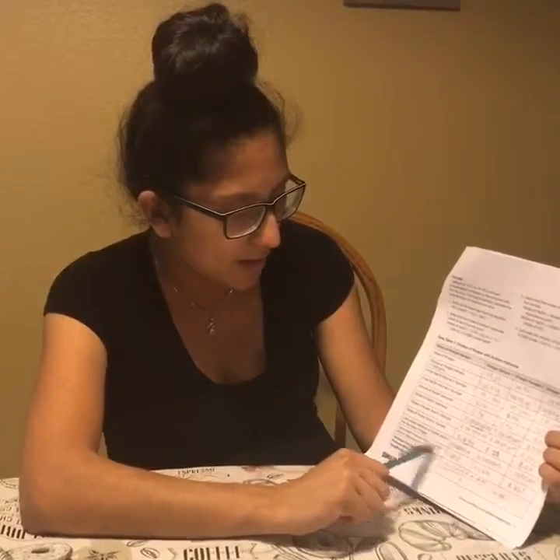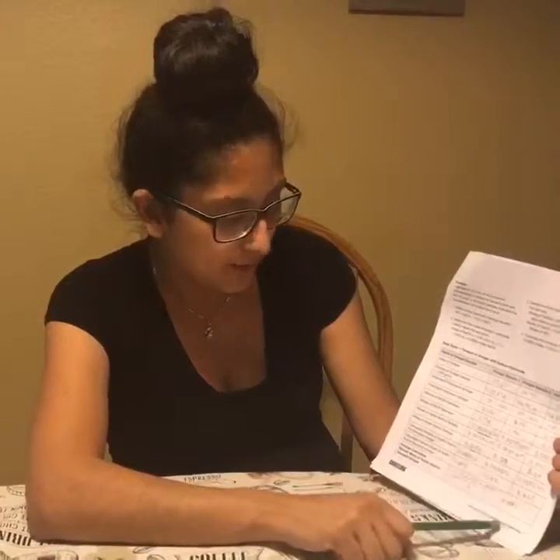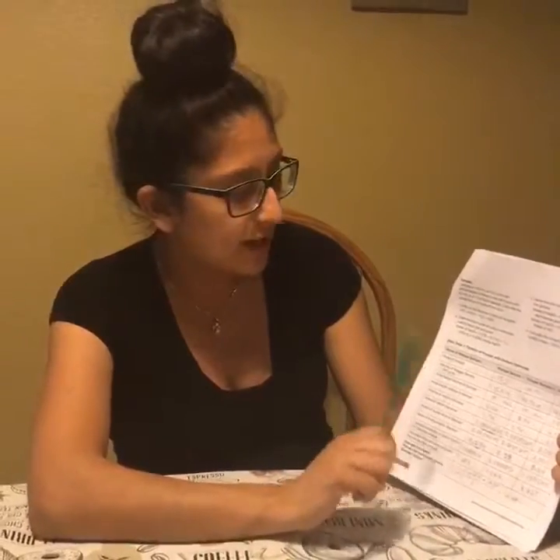And the average calculated mass was 34.89, which I got by adding the mass of all 3 vinegars and then dividing it by 3. And that was for data table number 1.